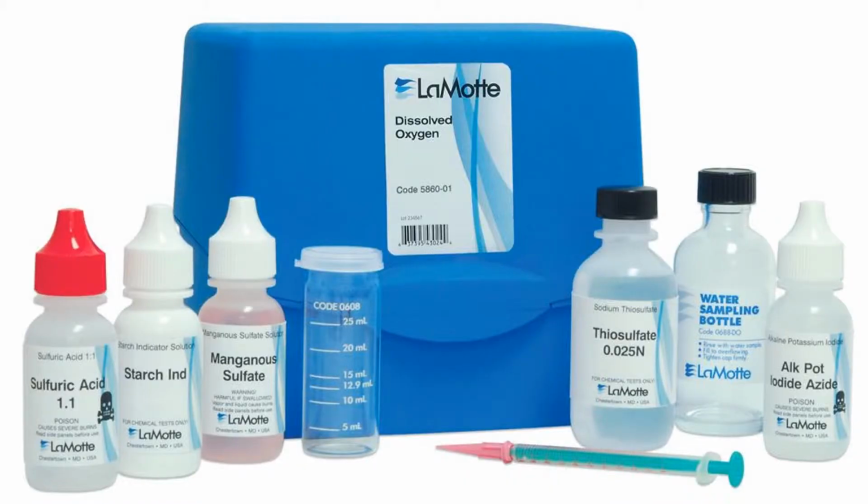Next, I will explain the steps of the dissolved oxygen test. This image shows the necessary equipment and solutions. These instructions are simplified and not to be used for executing the test. To better illustrate the chemistry behind each step, I will use ionic equations.